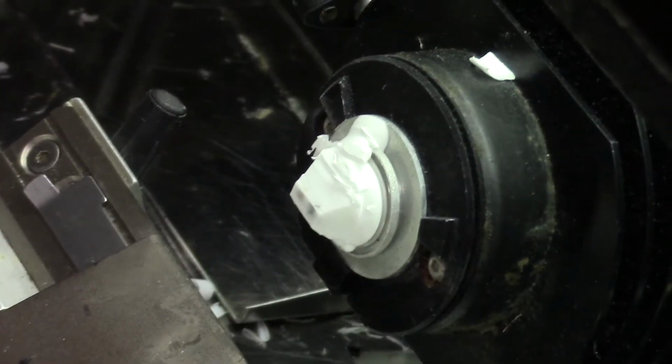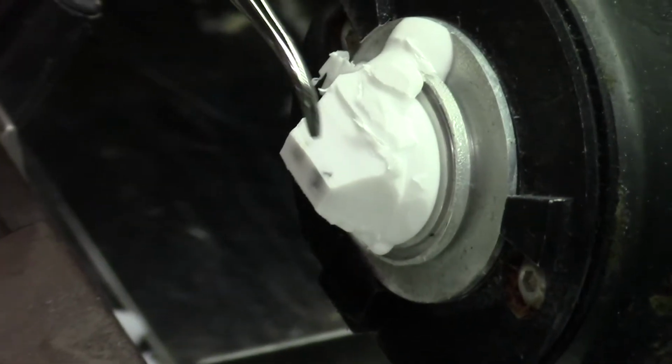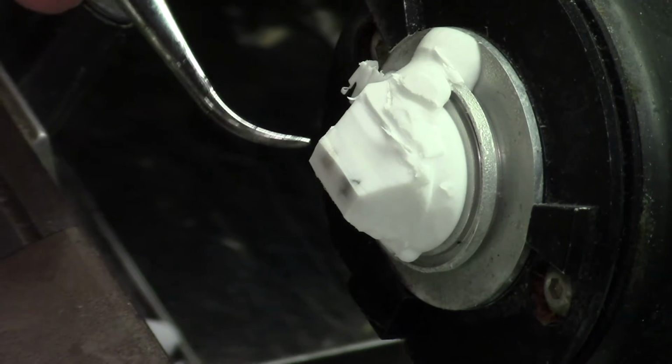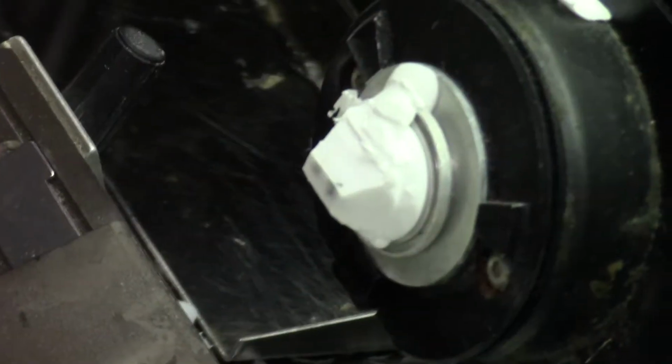So I'm done trimming my block. I would say I over trimmed it here on the top because we can actually see the tissue from the top. We only want to be able to see the tissue from each side. So this is going to be a much smaller block, and notice how that will be pretty easy to get multiple sections on multiple parts of a single slide.